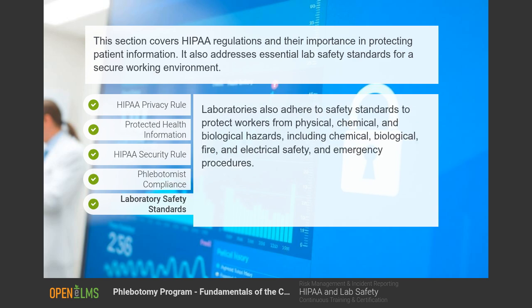Laboratories also adhere to safety standards to protect workers from physical, chemical, and biological hazards, including chemical, biological, fire, and electrical safety and emergency procedures.